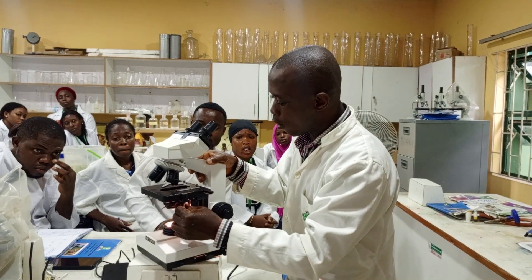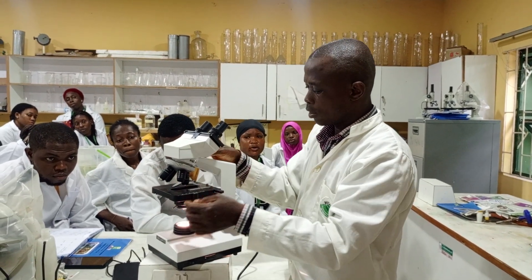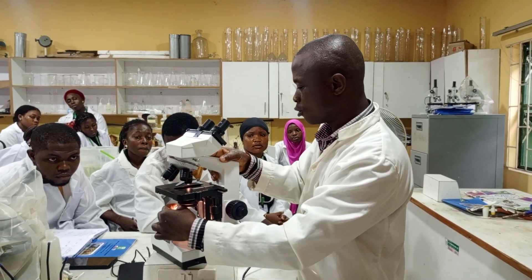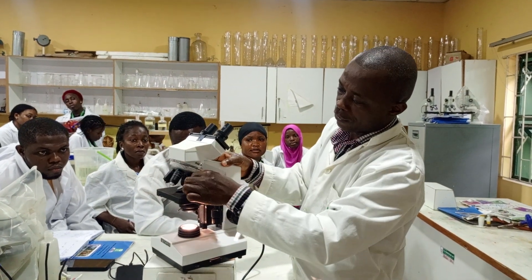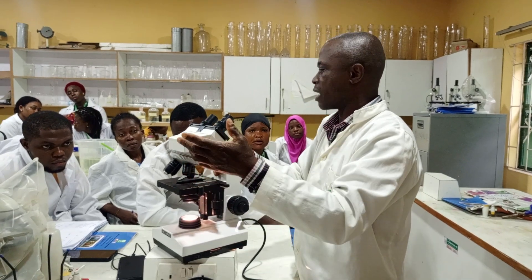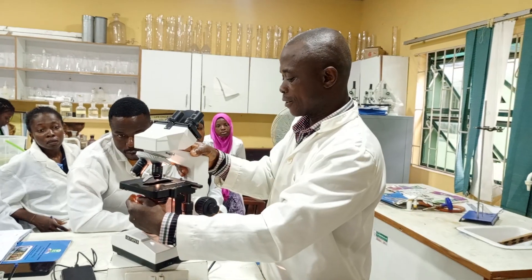We have what we call the iris diaphragm that controls the amount of light going into the specimen. You can see it increasing or reducing. When you are working with the lower objective — at least times 4 — you close the light; you don't need much light. But when you are using times 40, you open the light so you can see; you need more light.